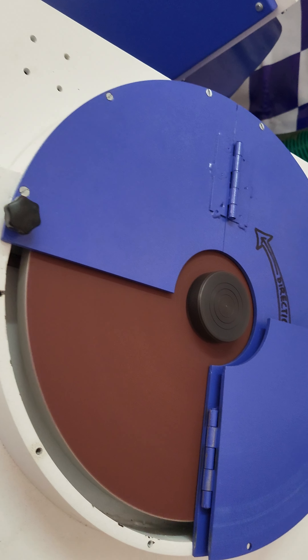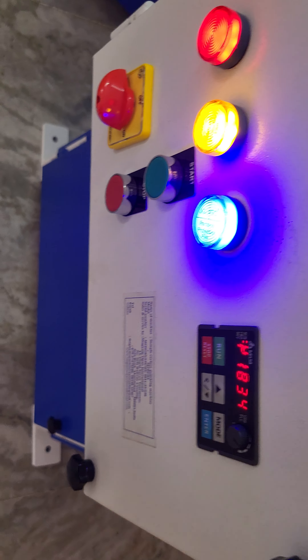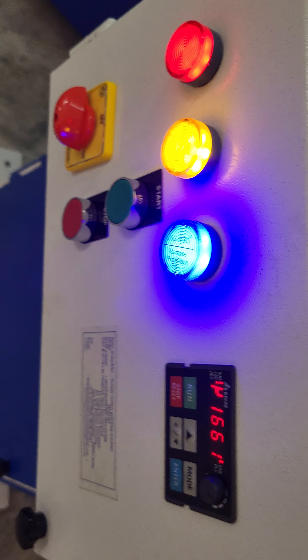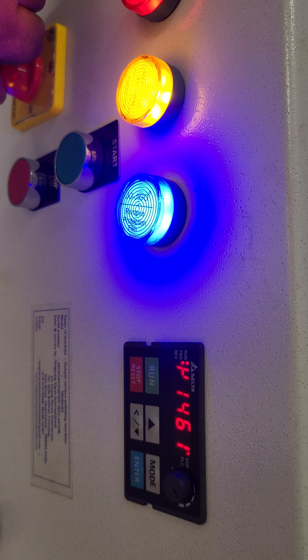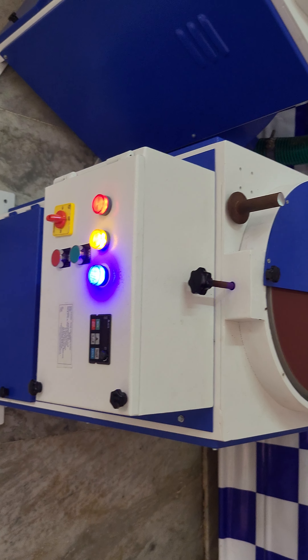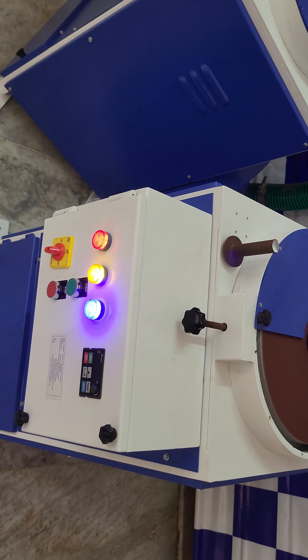Once your polishing is done, push the red button to switch off the motor, then use the rotary switch to switch off the power supply. That is all we have in our variable speed machine. Thank you.